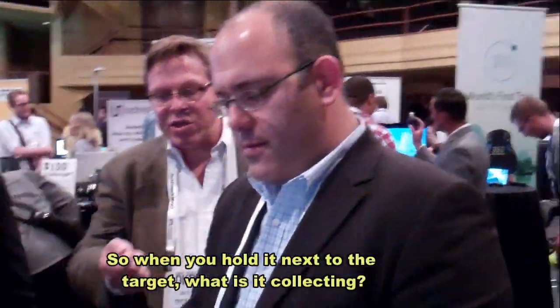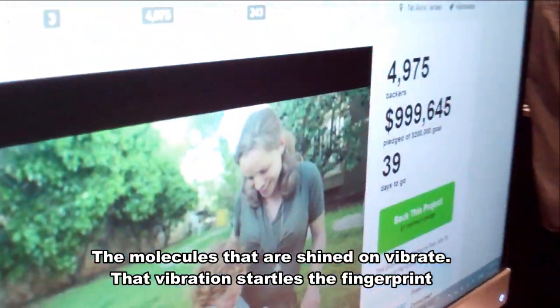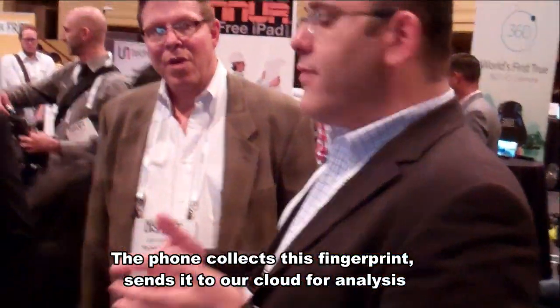We're going to do it now in real time. So when you hold it next to the target, it shines light on the target, the molecules that are hit vibrate — that's what we're going to find as a fingerprint. We collect that fingerprint and send it to our app, and then we're going to see the results within that.